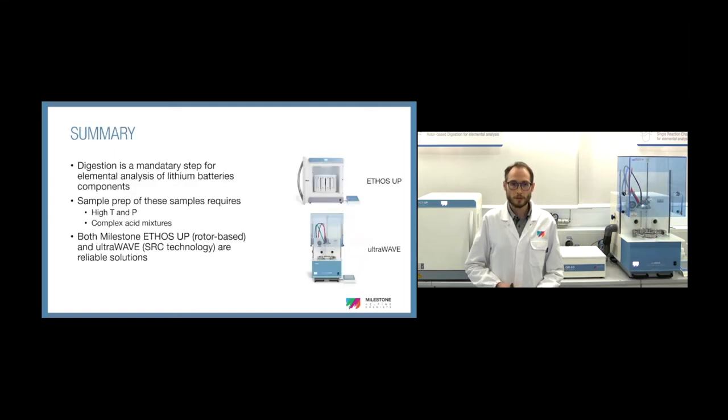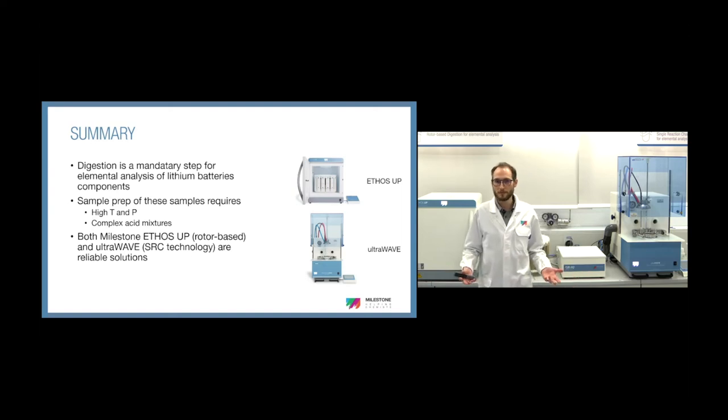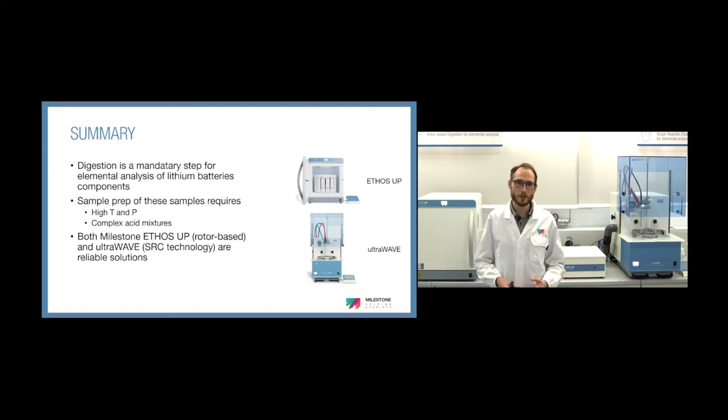These are just three examples that I collected from the ebook that you can see. In the ebook, you will find many other application notes. But anyway, we have seen during this presentation that digestion is a mandatory step, because most of the samples that you have to analyze are solid materials, and solid materials need to be dissolved into a liquid phase for the analysis with ICP.